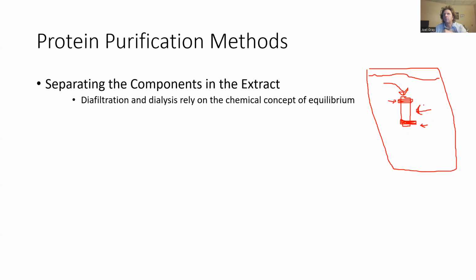So you're going to have a protein sample within this dialysis baggie, and you're going to place that dialysis baggie into a larger container. Now, what this is related to is it's all reliant on equilibrium and concentration of different substances. You're going to have a high concentration of protein within this tubing, a low concentration of protein outside of this tubing. And what's slowly but surely going to happen is protein or some substance is going to leave the dialysis tubing and populate this larger container.